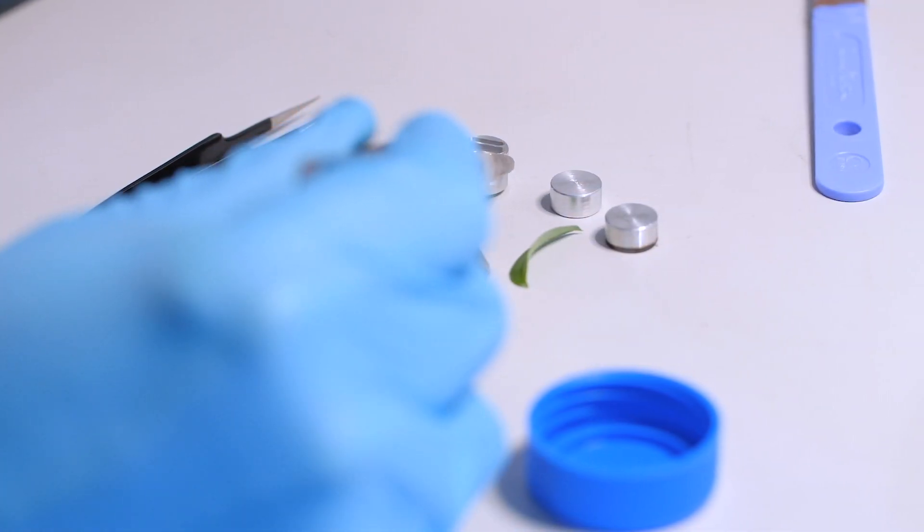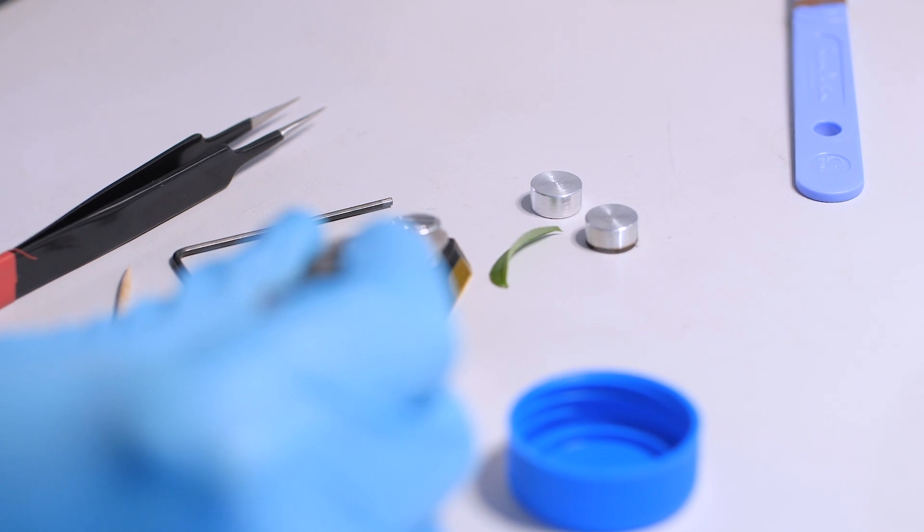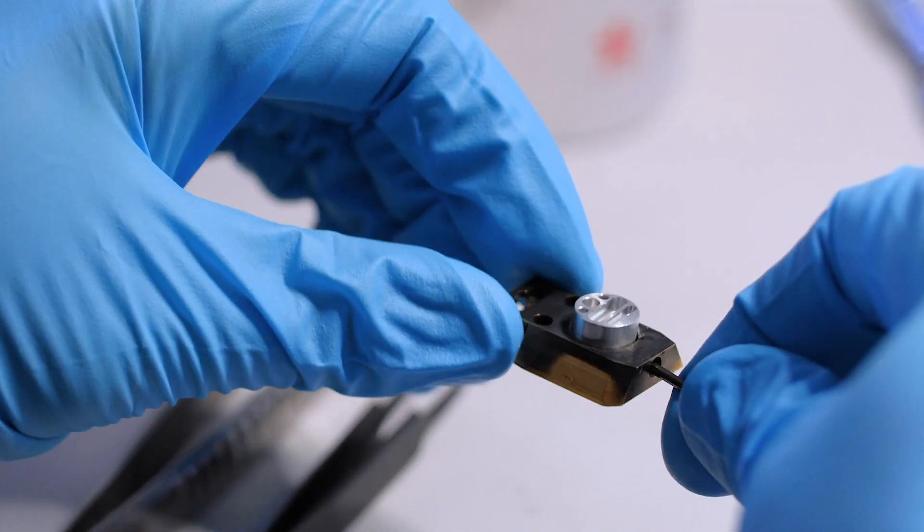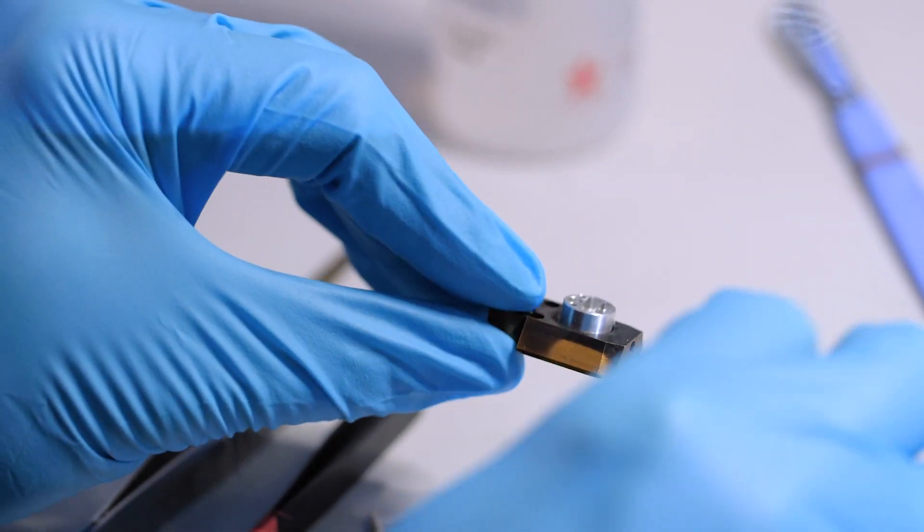First of all, he selects the stub holder he's going to use. He then inserts it into the shuttle and clamps it, making sure that it's held firmly.